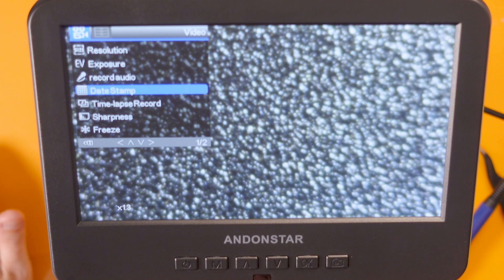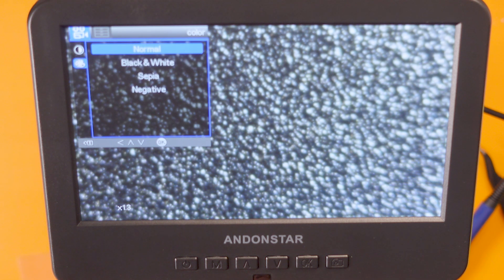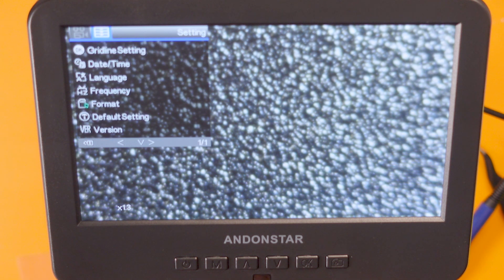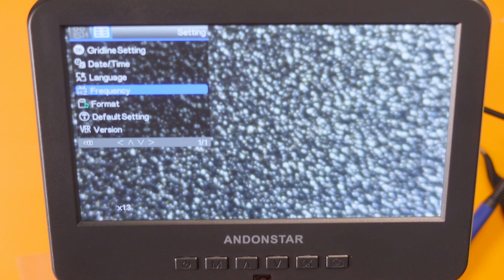Pressing menu again: we can have grid lines on — that's pretty cool. Change of the date and time, language, and frequency. For the UK you have it set at 50Hz and for US and other countries it's at 60Hz. There's also format — I'm not going to format the card because I'll just lose the recording I've made — default settings to reset to factory default, and the firmware version.